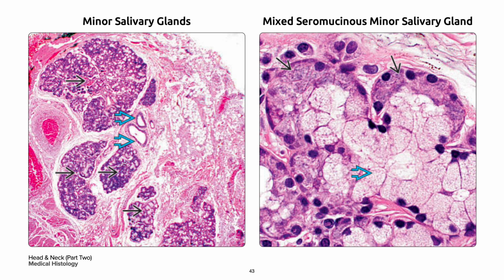We have three types microscopically: mucous, serous, and mixed seromucous. We also have important microscopic parts: the acinus, mucous cells, serous cells, myoepithelial cells, and ducts such as intercalated ducts, striated ducts, and excretory ducts.